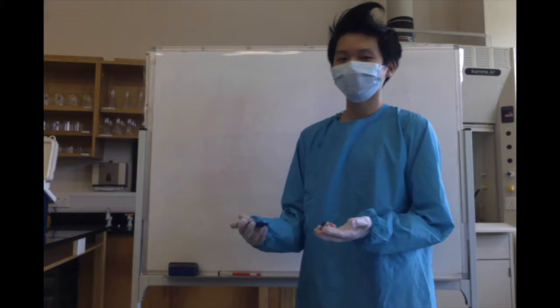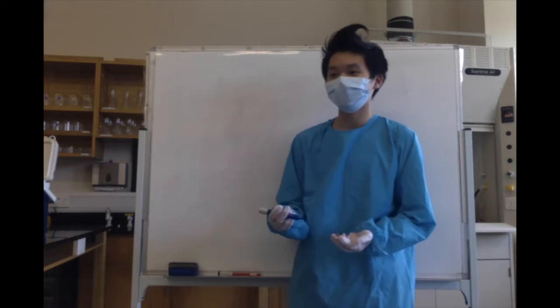Welcome to the eye dissection. So in this dissection, we'll be covering the basic anatomy and physiology of the eye.